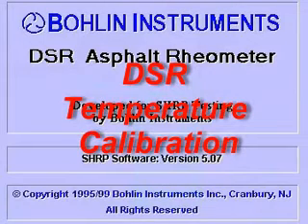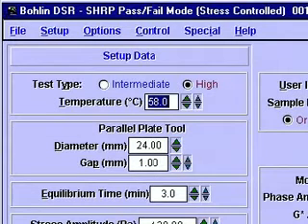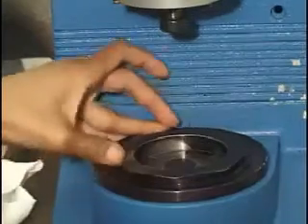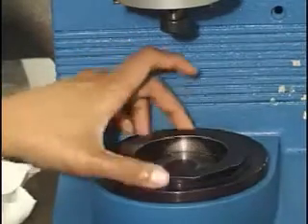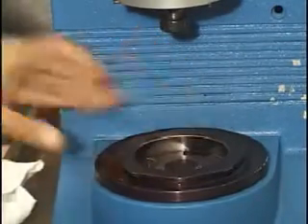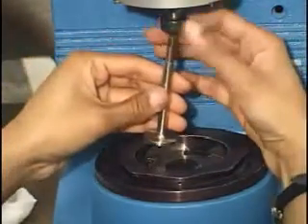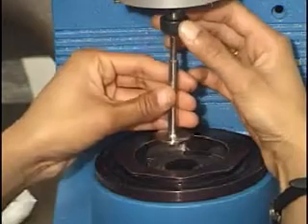DSR Temperature Calibration. Turn on the DSR and run the DSR program. Set the rheometer to the desired test temperature. Screw the test plate on the fixture and tighten it firmly. Attach the corresponding spindle to the upper shaft.